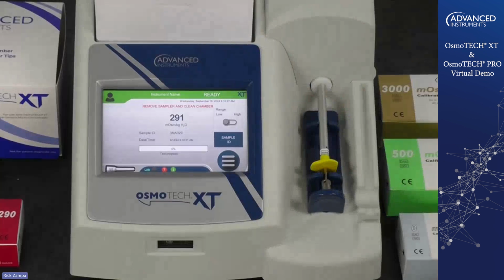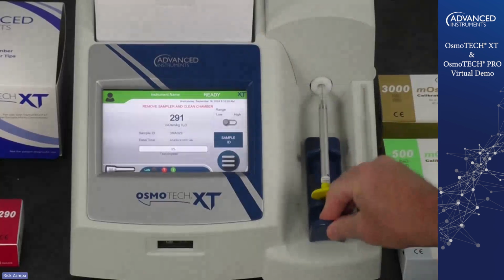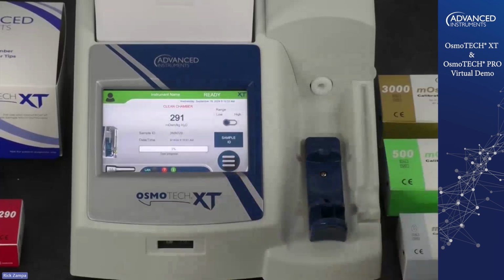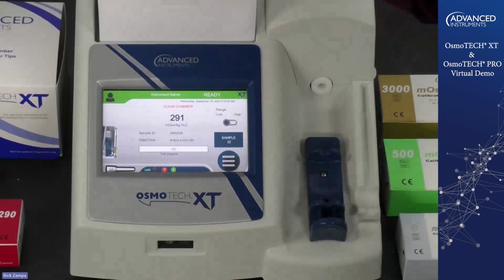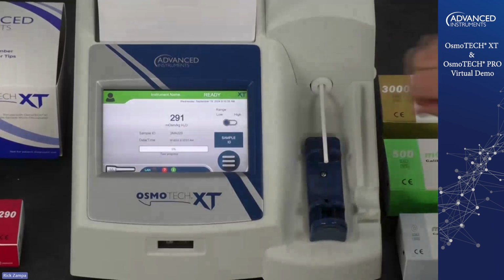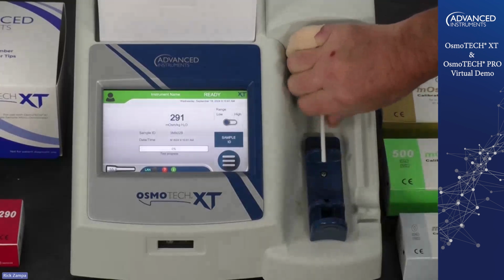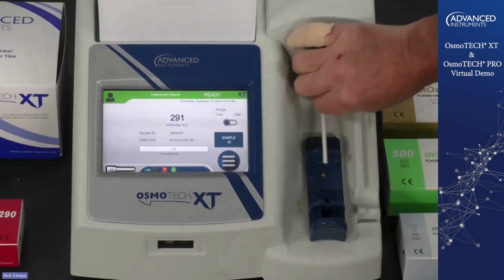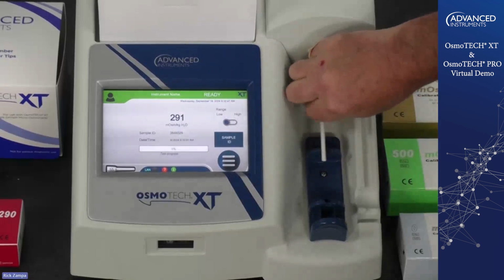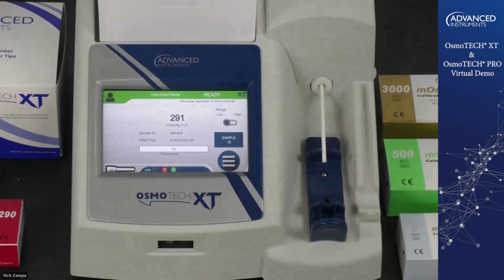So now, once we have completed our test, you can see this flashing. It says remove sampler and clean chamber. So what I need to do is remove this sampler from the chamber. Then I want to take one of these chamber cleaners, insert it into the instrument, and twist it each way a couple of times. Take it, flip it over, insert it, do the same thing, and leave it in there.